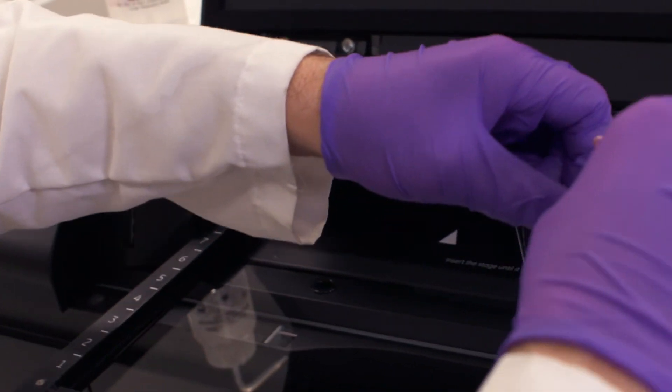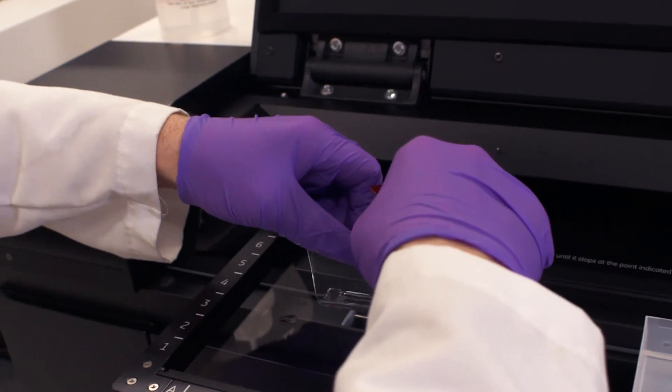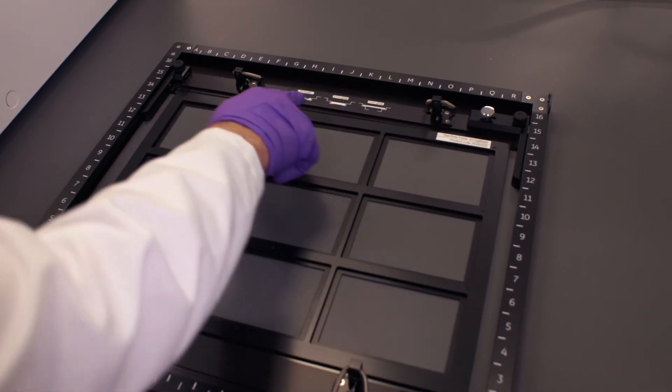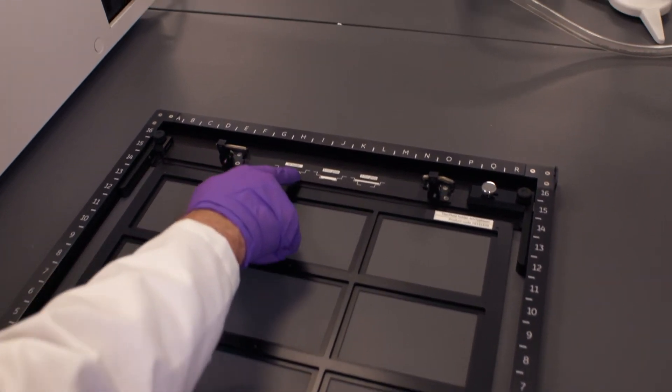There are accessories in the machine to enable imaging of large format sequencing gels, working with microtiter plates, and glass slides.